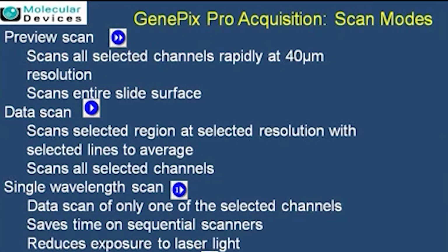So it's like any general scanning, even if you just want to scan a sheet. First of all, you would like to preview it, to get a glimpse of the process, like how the overall image looks. And then since you know your experiment and your requirements, like what wavelength needs to be used and what type of fluorophore you have used, one needs to optimize and correct those things during the data scan, which is the actual scan performed. And then after that one needs to review the whole thing and see how the slide looks. True.